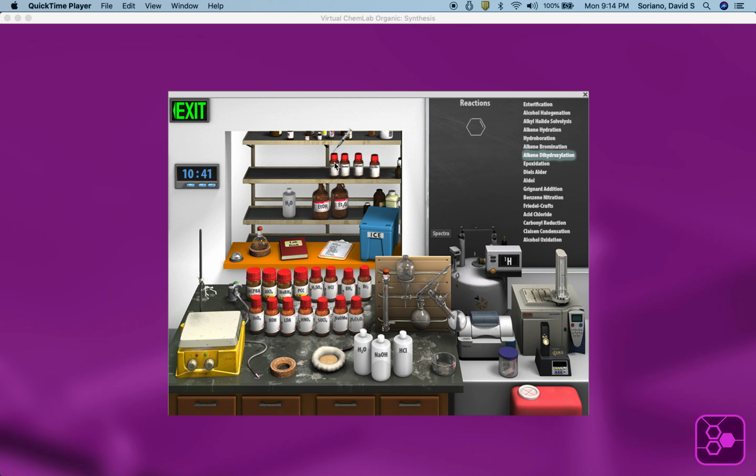So what I will do is select cyclohexene, double click. Let's try to drag it with the syringe. I have trouble with that. Let's see if it's there. Well, how do you like that? I got it to work. Early on, I had a lot of trouble with the syringe delivery. If you don't use the syringe icon, double click on the reagent.